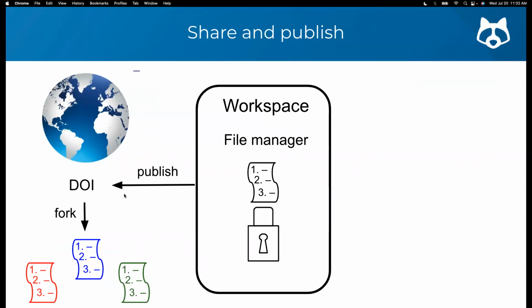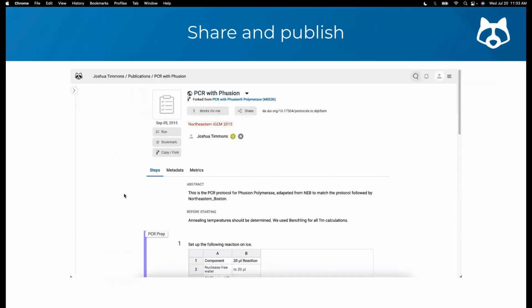Once a protocol is published, any reader can copy it and modify it according to their needs, but the platform has a memory that will link any copied protocol to the original one. In this way, the author will maintain and earn credit.